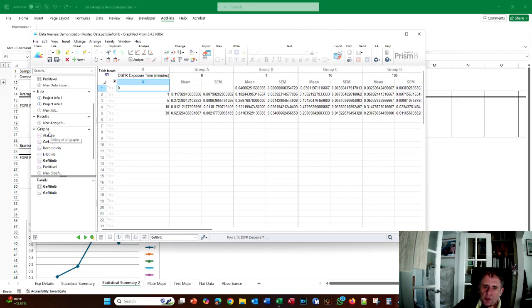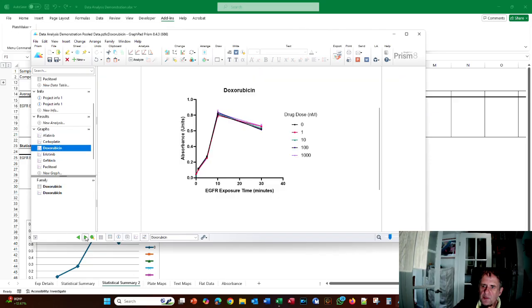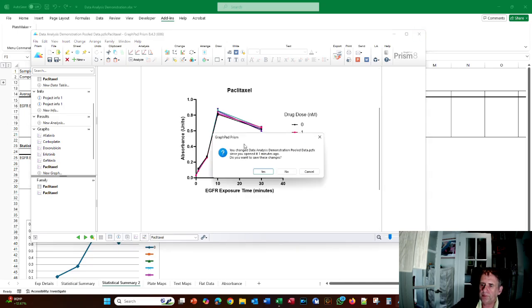And these are the appropriate graphs for each of the 6 compounds. So you can see that now we've extracted and visualized all the data of these 9 96-well microtitre plates that form part of this time course experiment.